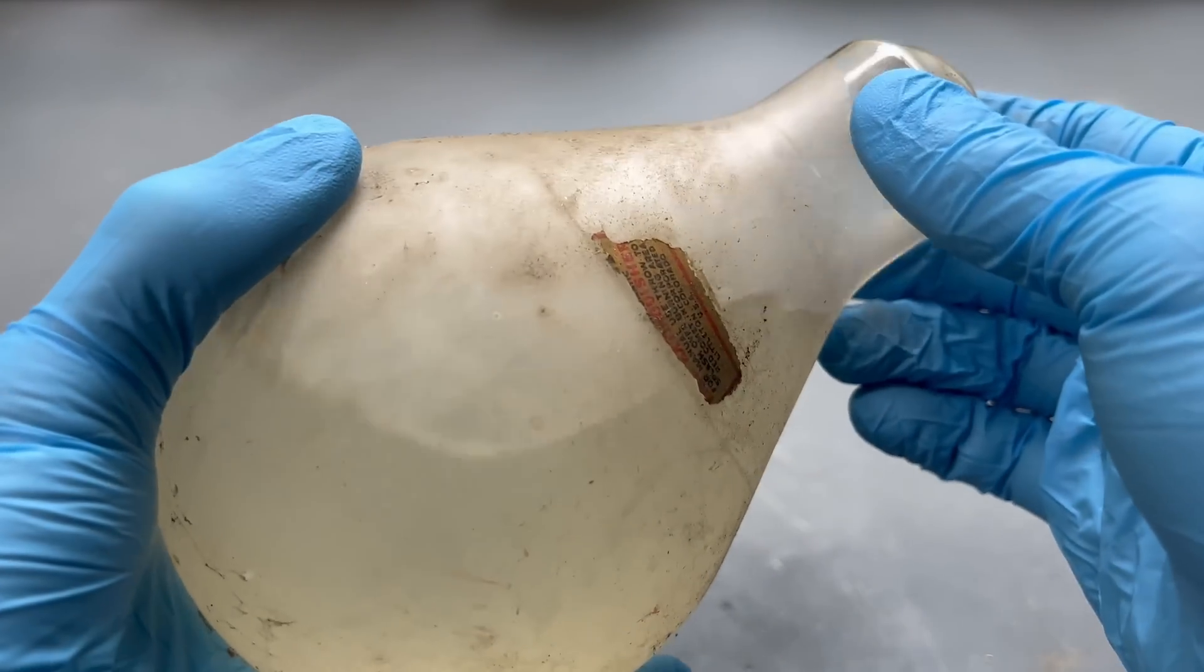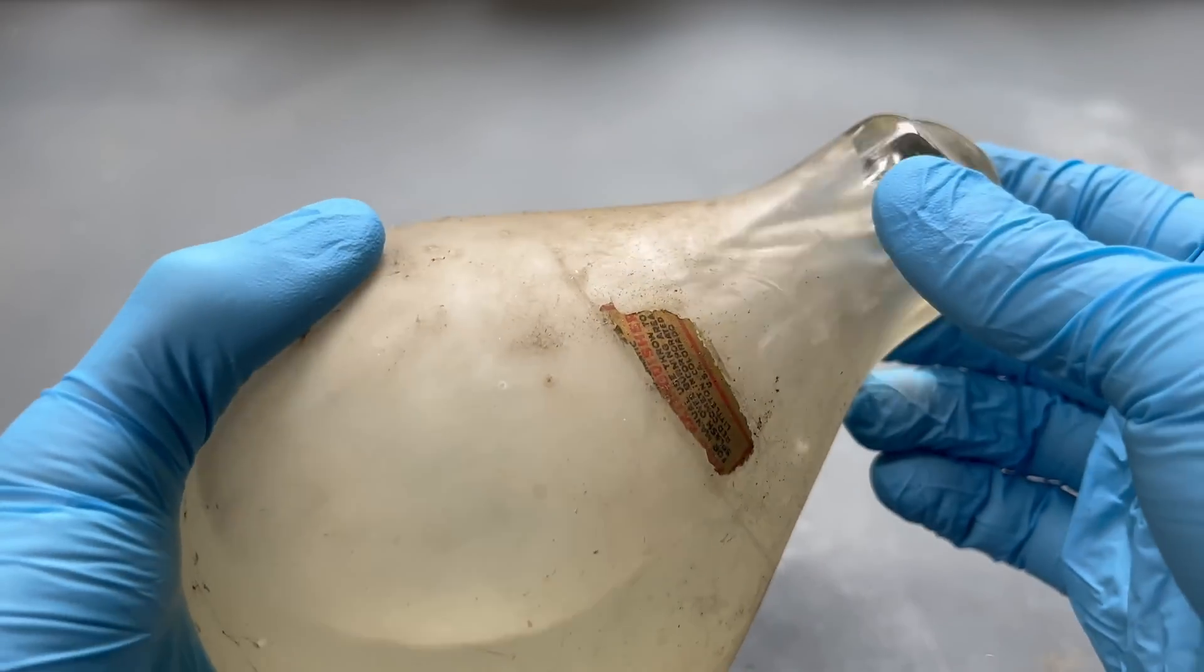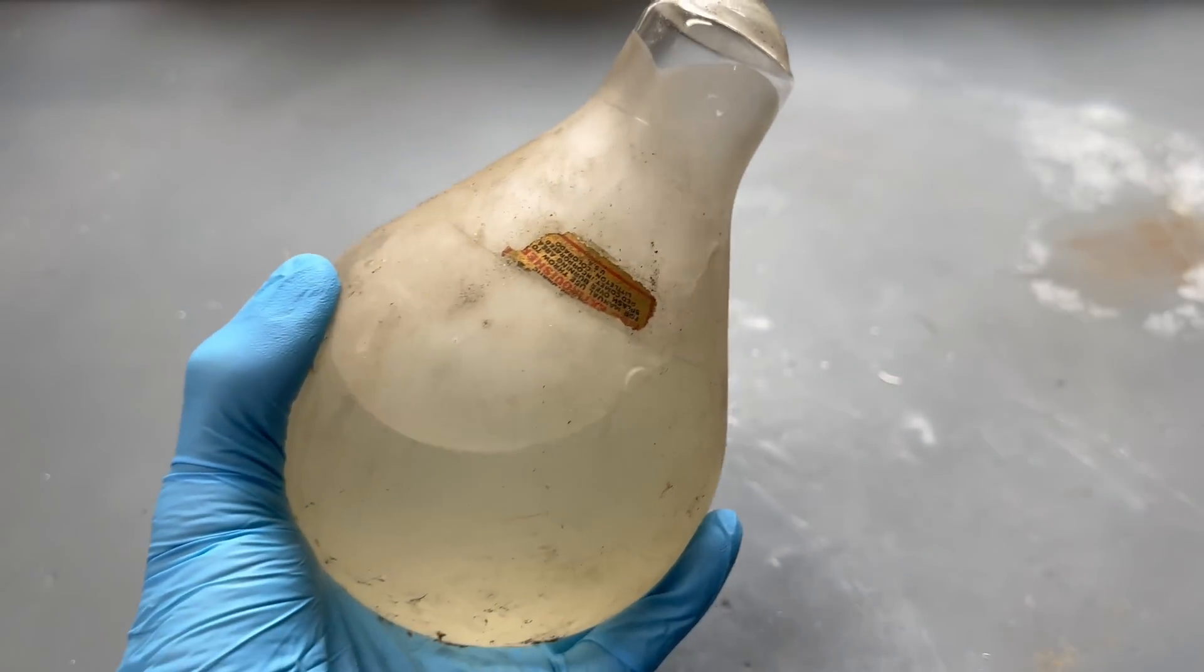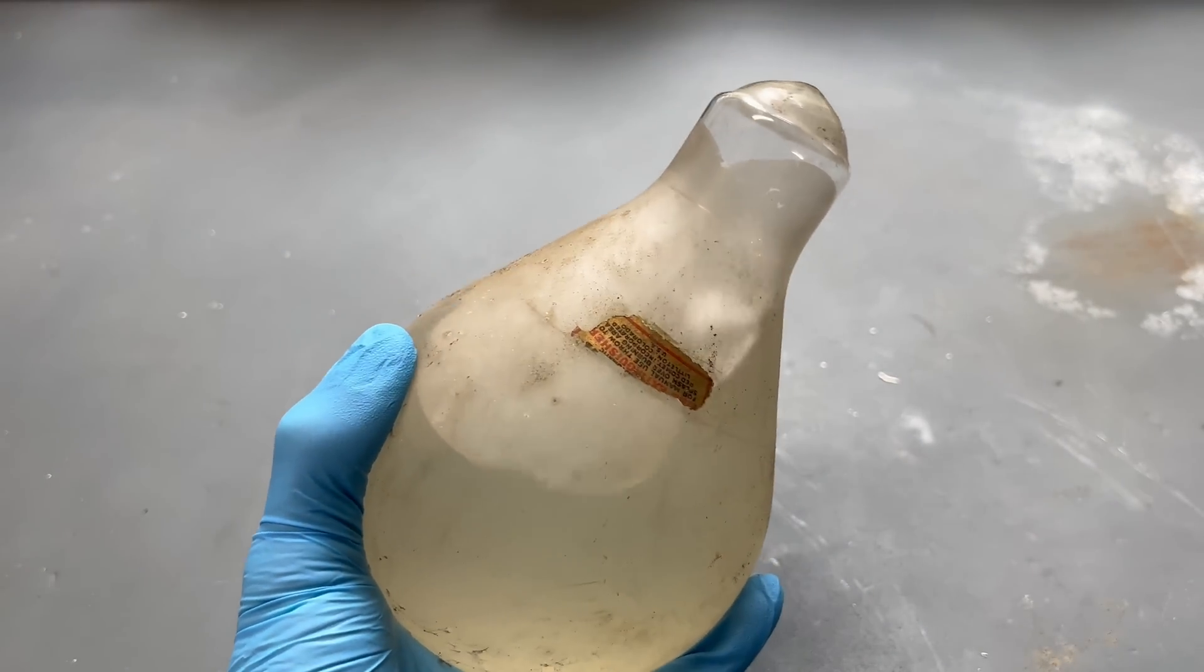Carbon tetrachloride was once a prevalent household chemical. Carbon tetrachloride was used in lava lamps, refrigerants, and fire extinguishers.